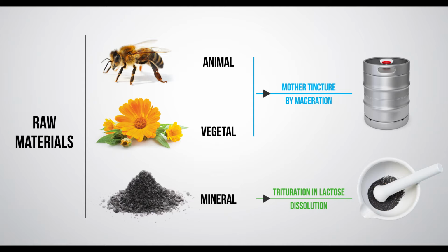And crushing will be used for any mineral that is not soluble in alcohol. In that case, we will use the powder base that we call lactose, and we will crush it as such. The first step is mother tincture or crushing, depending on the initial source.